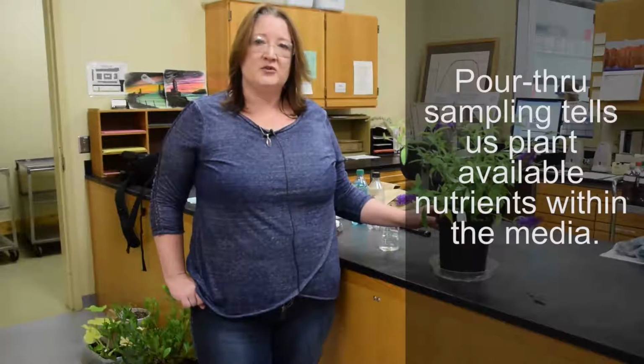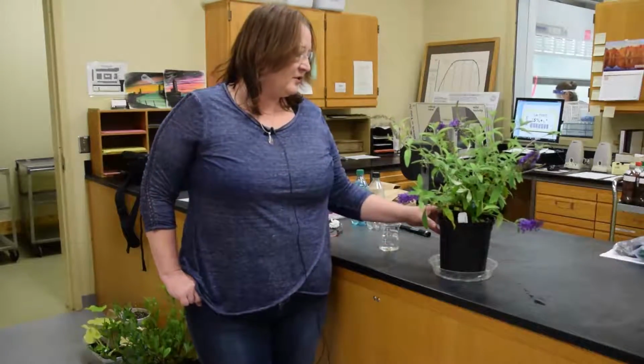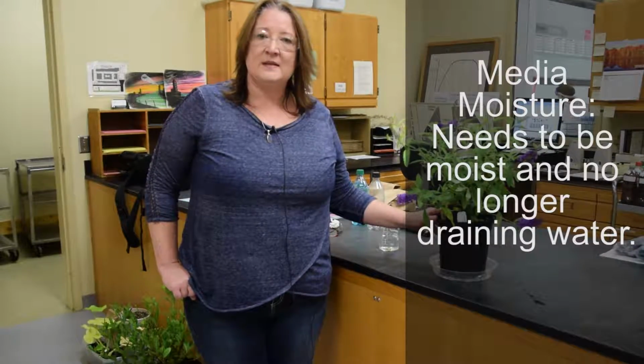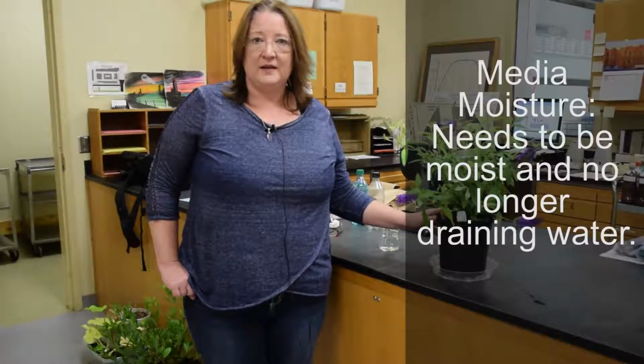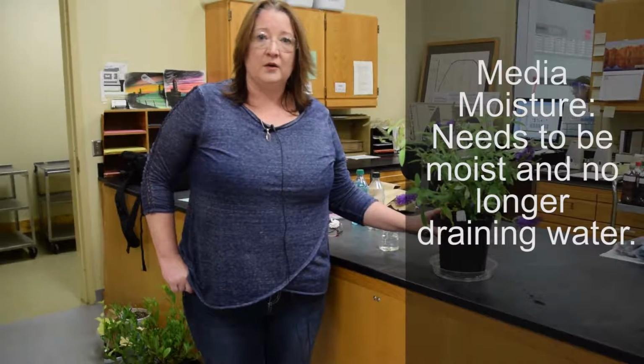Next, we are going to demonstrate how to take a pour-through media sample. The purpose of the pour-through sample is to determine the concentration of plant-available nutrients in the media itself. The first thing you do is make sure that your plant is evenly moist but not overly saturated. It should be fully moist but no longer draining water.